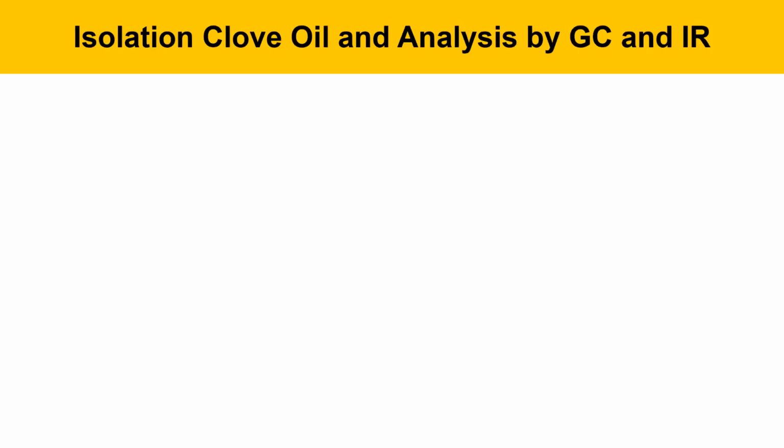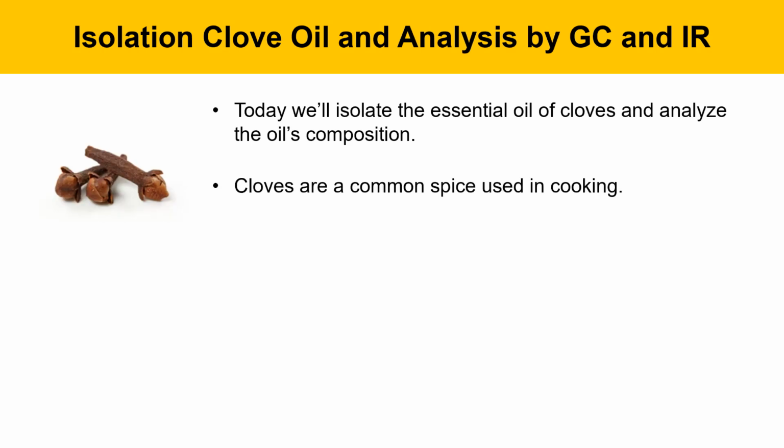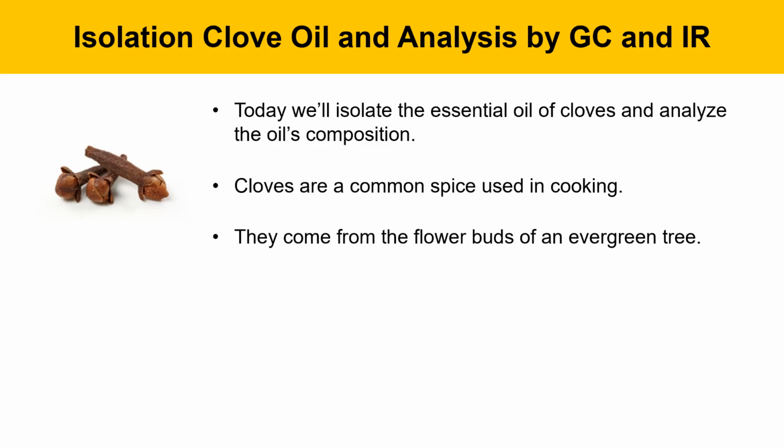This slide describes the isolation of clove oil and analysis by GC and IR. Today we're going to isolate the essential oil of cloves and analyze the oil's composition. These are cloves. Cloves are a common spice used in cooking. They come from flower buds of an evergreen tree, and chances are you may have these in your kitchen.